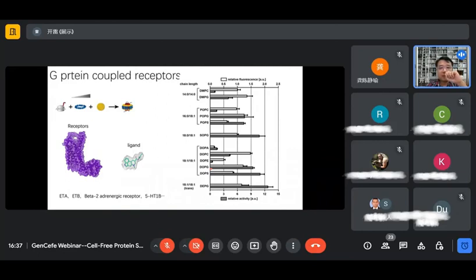And we really spent a lot of time to establish a standard sample preparation protocol that is suited for ligand screening, which of course is the key task that we investigate for GPCRs, because we want to develop a drug that really can tune the activation or inhibition of GPCRs.